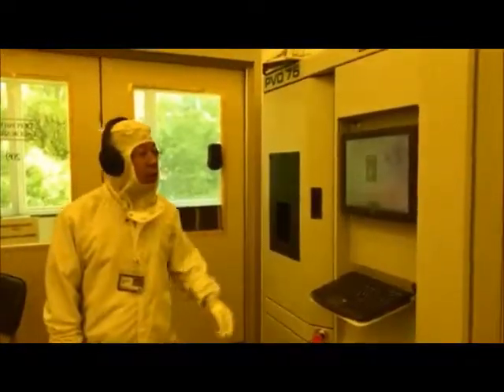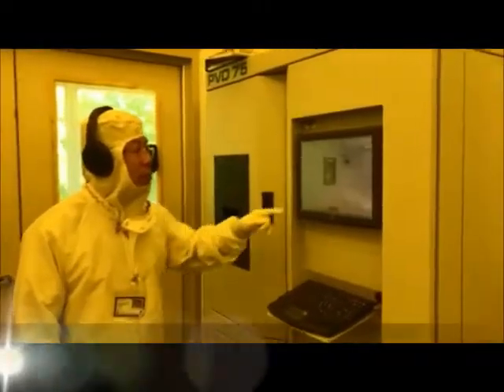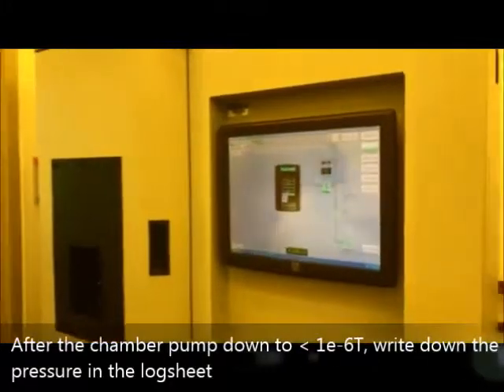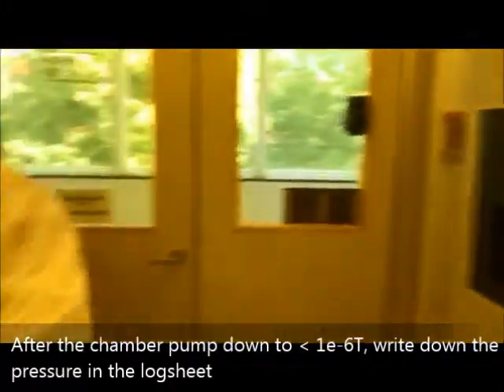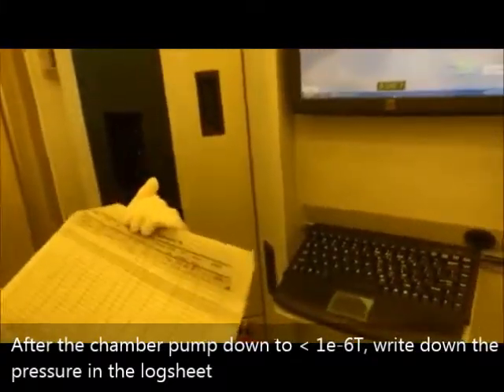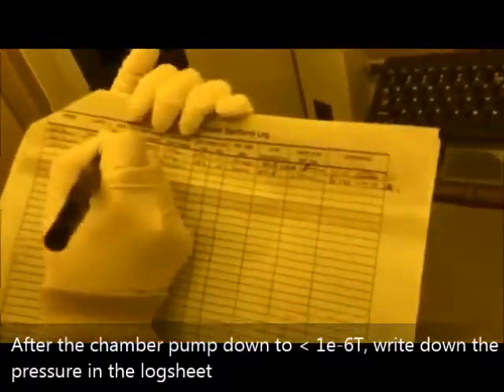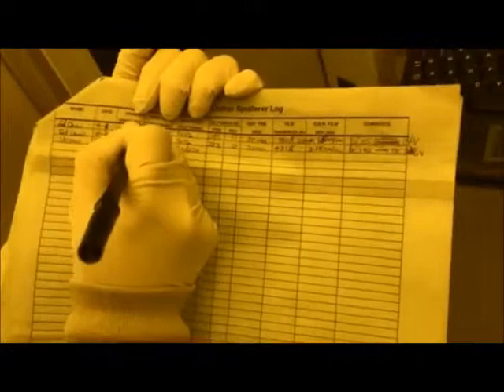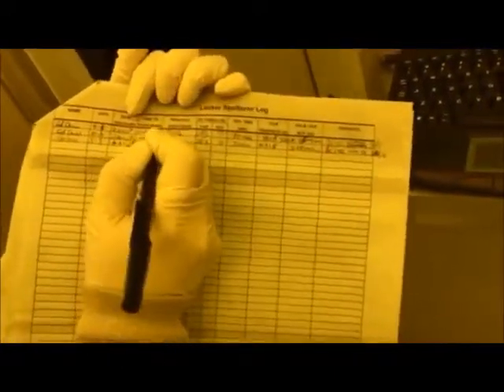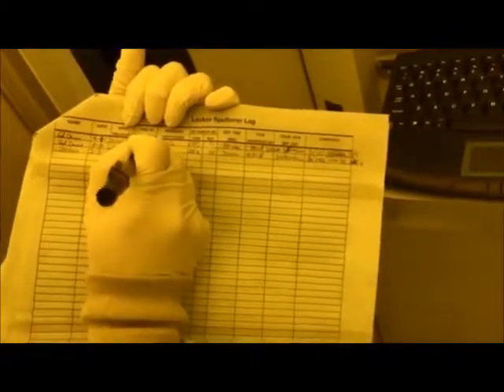When you first come in for the deposition, you look at this pressure, and you write down this pressure on the log sheet. So the pressure here is 5.2 times 10 to the minus 7. So I'm going to write down 5.2 times 10 to the minus 7. And then for the time to pump down, we pump down overnight, so we'll just say overnight.